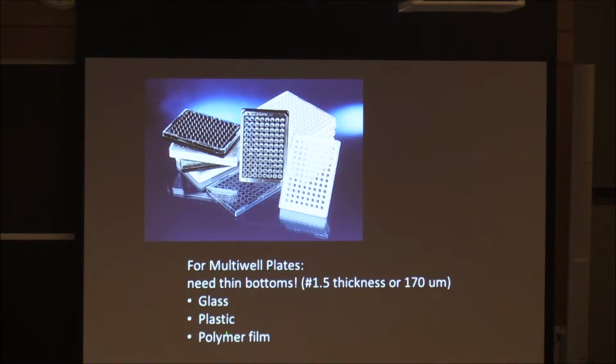And they come in 3 different types. So they'll come just with a standard cover slip glass bottom, which is basically the plate is just stuck to a big massive cover slip.